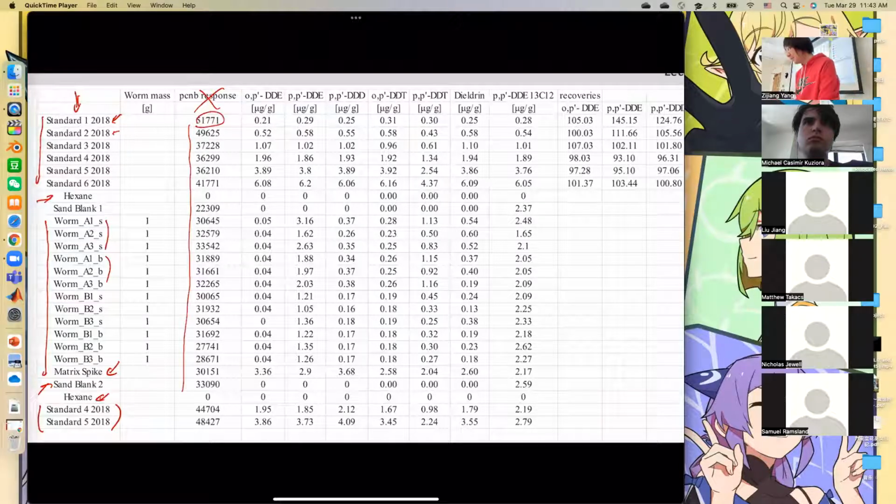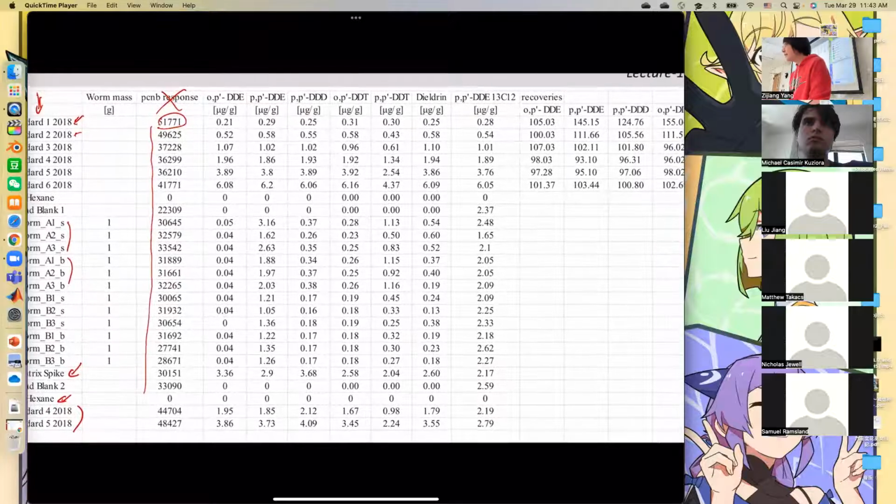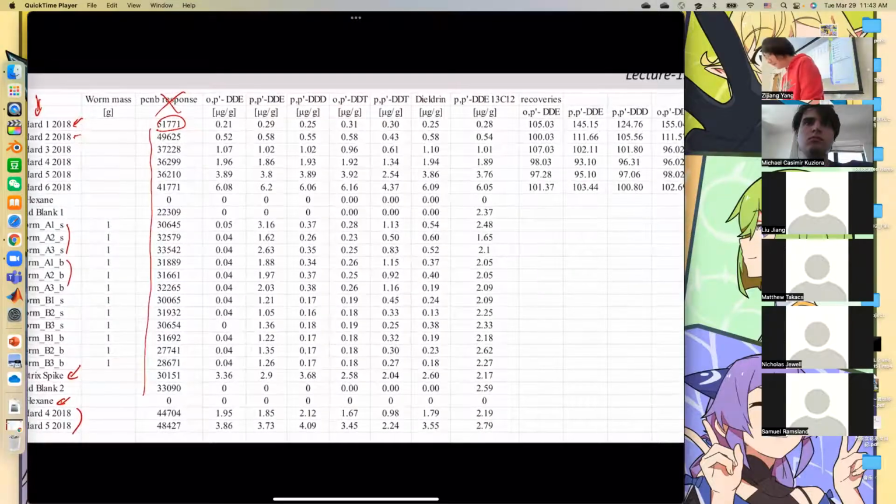And we can say this is not quite good, but it's okay. Is it the area? Excuse me? Is that the area of the curve? Yes, yes. So this is the area of the internal standard, but in this class we do not have to worry about this one.